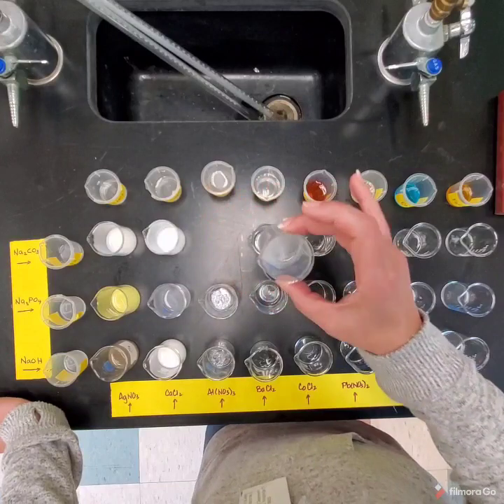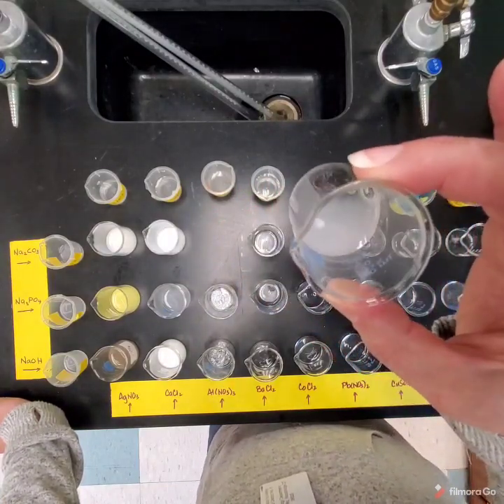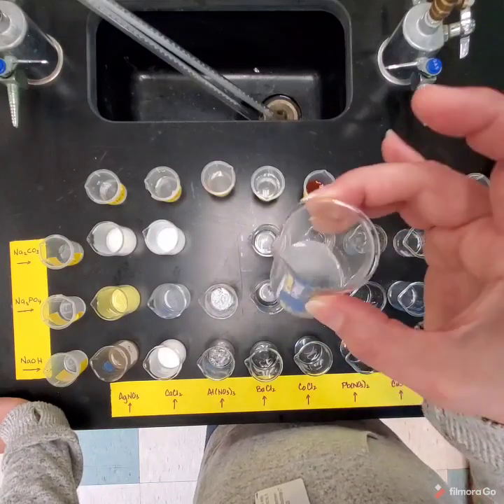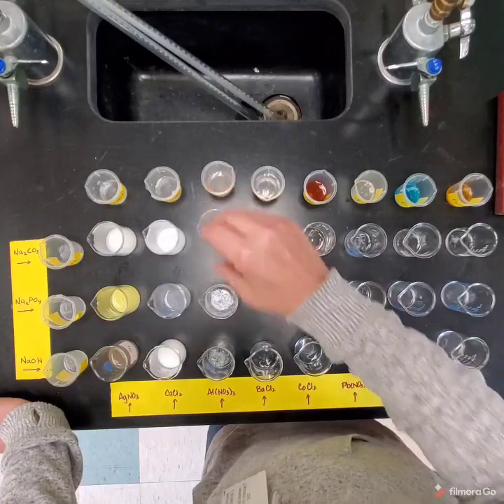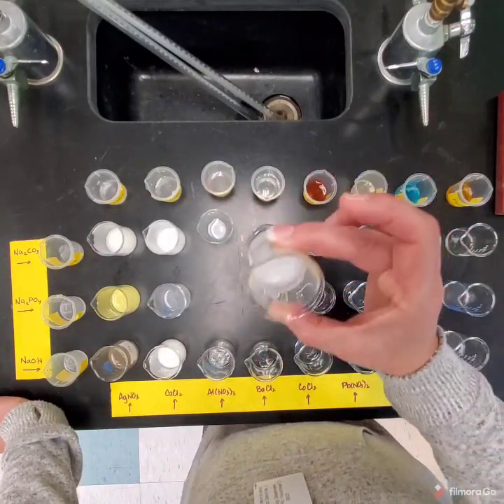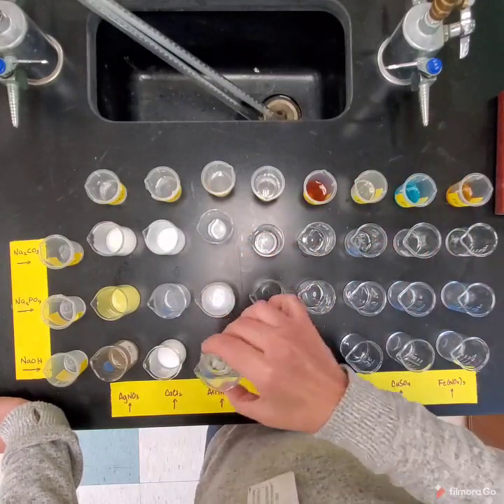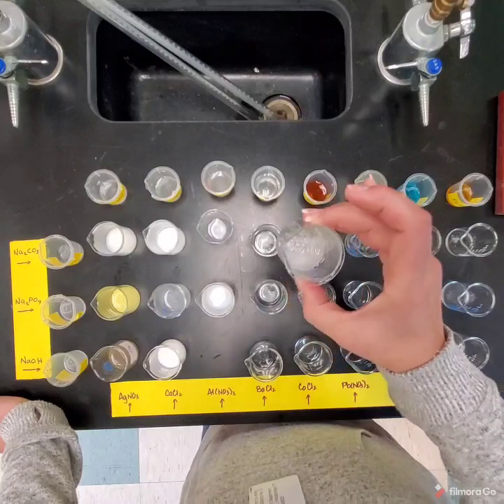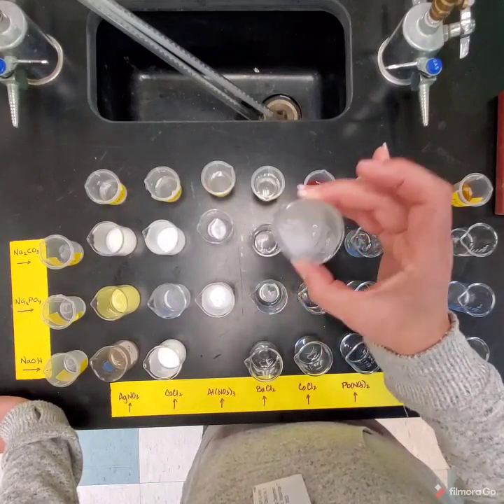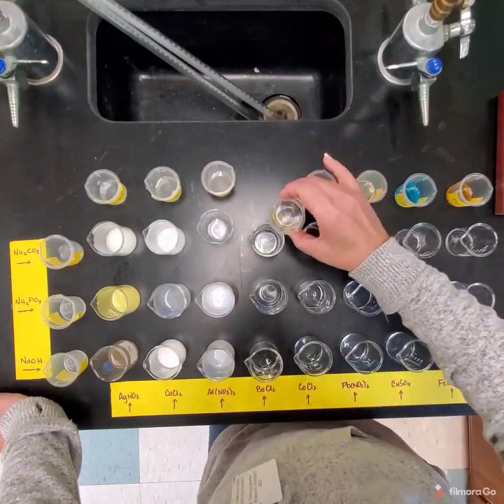Okay, so here is aluminum nitrate and sodium carbonate, and then you can hear there's little bubbles going off as well, which means a gas is being given off in addition to a solid. This one, see how it kind of just immediately gelled up and got goopy? And here's another one that's just kind of goopy. That's the scientific word, goopy. Okay. All right, next group is barium chloride.